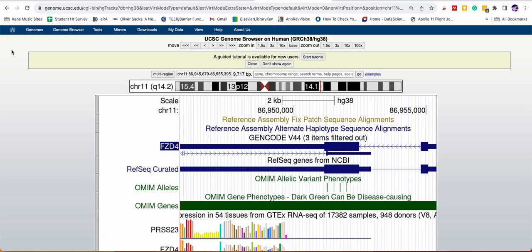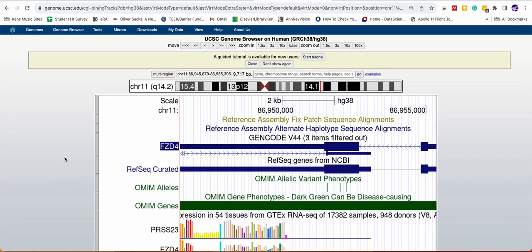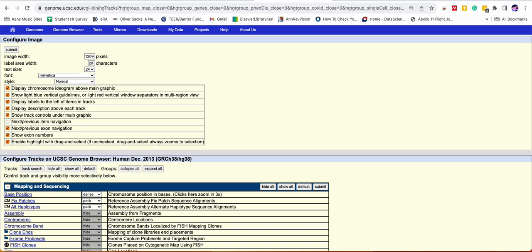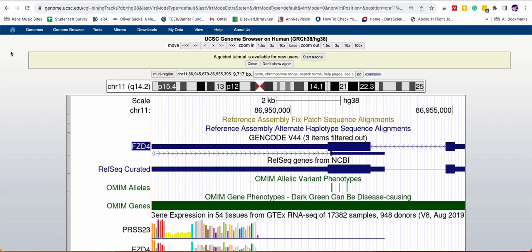Boom, and we go back to the view again, and things are pretty good. I might even want to make it bigger, and so if I want to do that, I will just continue to do that. But get things where it's comfortable for you to look at. So I got a little bit wider window now. All the labels are a little bit bigger.